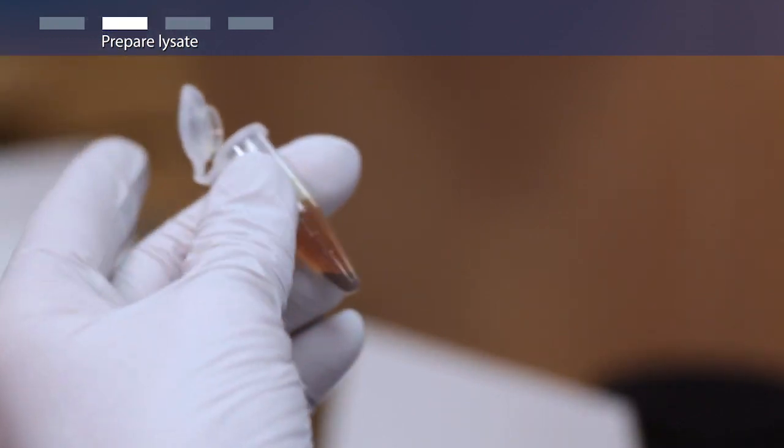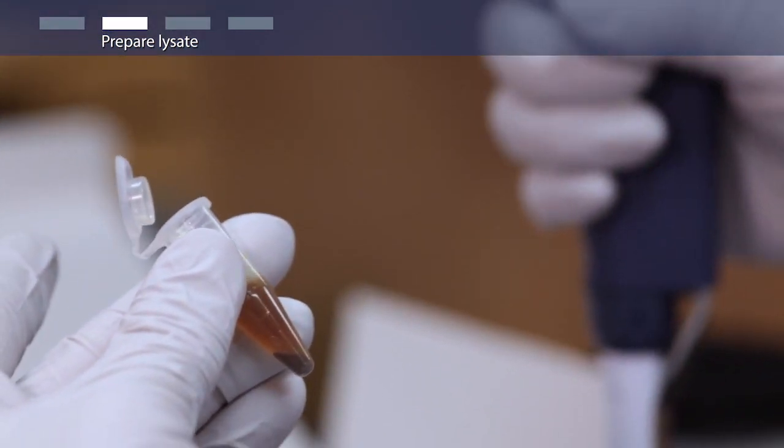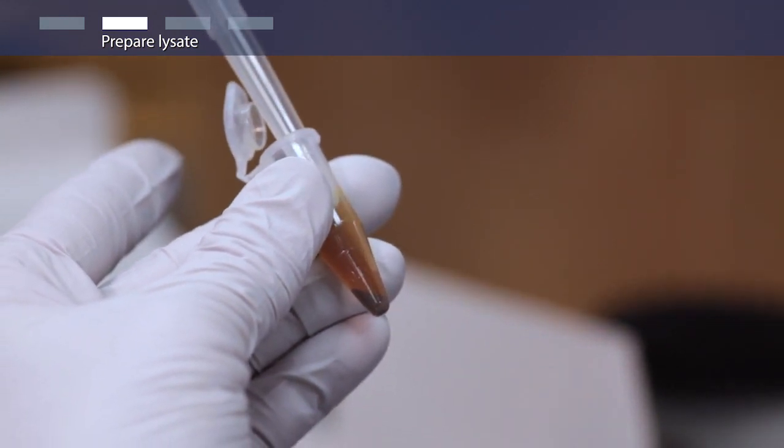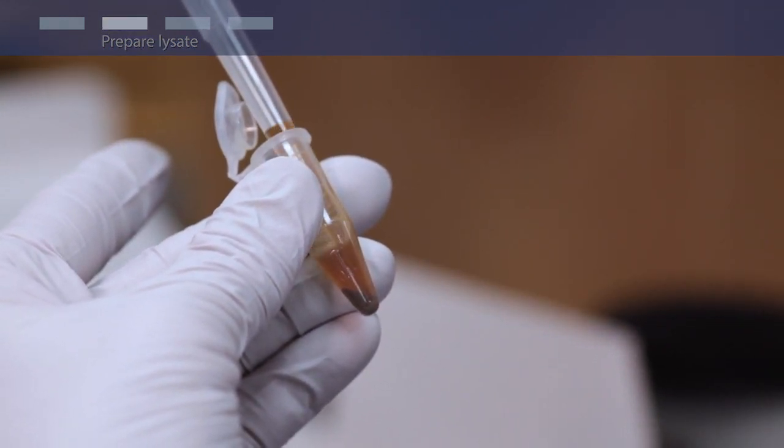Following a 2-minute centrifugation at 14,000 G, transfer up to 500 microliters of the supernatant to a clean microcentrifuge tube, avoiding the pellet and any debris.